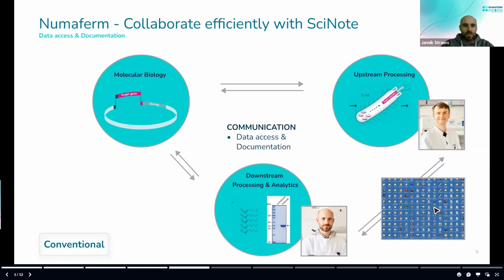We have a system in place, obviously, for storing data and naming folders that makes it easier to navigate. And this works well on a top level. But when you are trying to find specific experimental data, potentially generated by a different department, by someone who may organize their data a bit differently on sub-levels, then it gets very difficult. So quite often I actually need to ask Andreas to dig out the data for me, which isn't very effective.